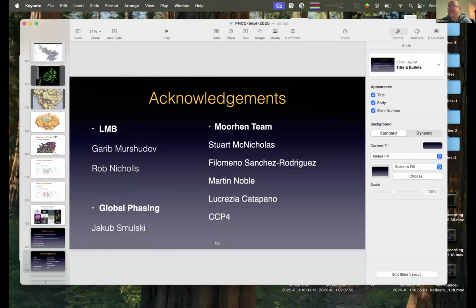Yeah, I've forgotten his name. Sorry. I've forgotten your name. So Coot implemented that method. I read their paper, implemented their method. I added symmetry so that we can have symmetry-related atoms, which I don't think was in their protocol, but it's added in Coot. It's called electron shielding analysis, and you can use that to determine what is a water and what is a metal.